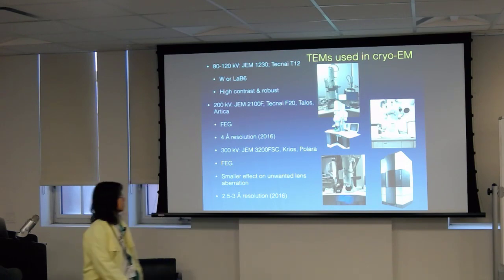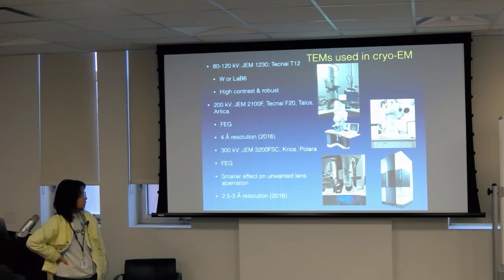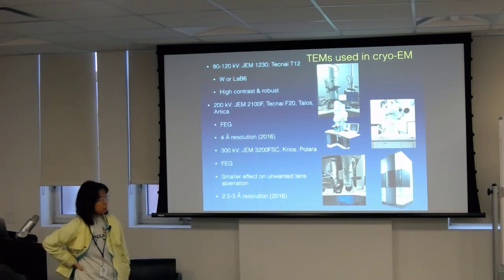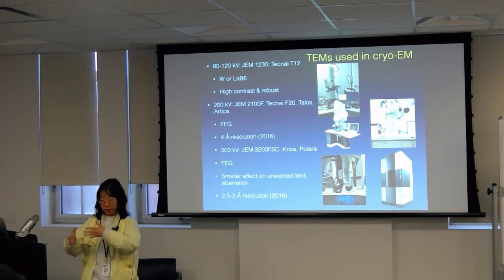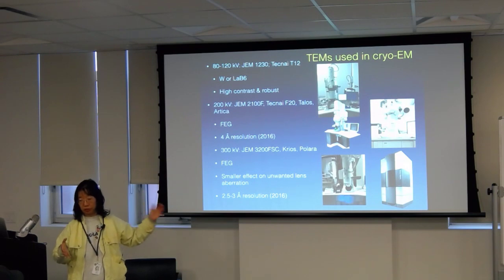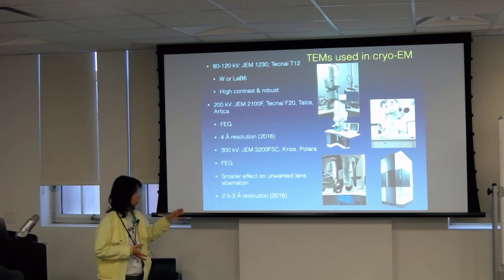Okay, you get all those things working out right for the voltage that you are working at. So all those things make them in general more expensive. And now to top that, now they add all this insulation to make it more stable on the Krios, and then the Cryo ARM is the same thing for the JEOL. We are going to do that for the 300 kV.